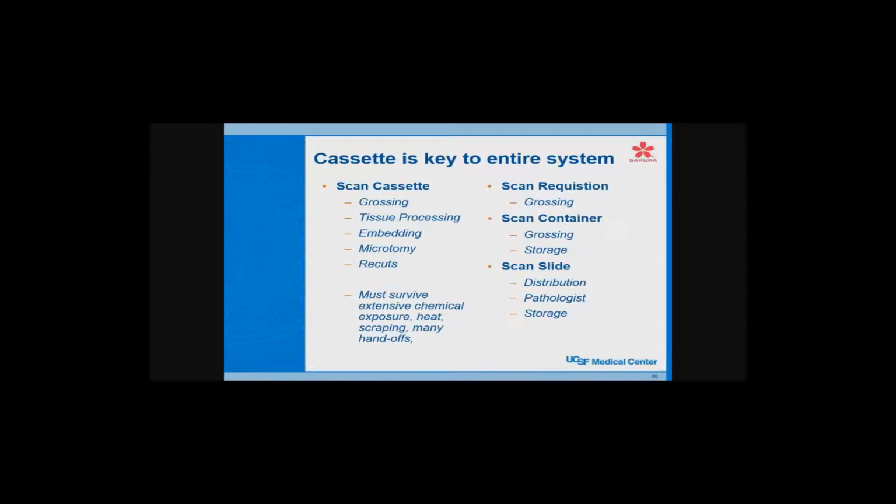and that the print survives everything you're going to throw at it, because these things are going to go through all the tissue processing, they're going to go through decal, they're going to be scraped and embedding, they're going to be knocked around. So they really have to survive everything. We did a lot of testing in cassettes. I mean, we put them through all the process, start to finish, hundreds of them, and then we would scan at every step to be sure that they were working. And we really have had very few problems with cassettes.